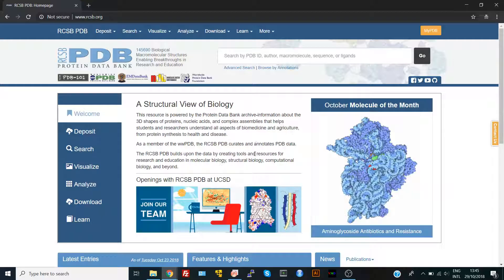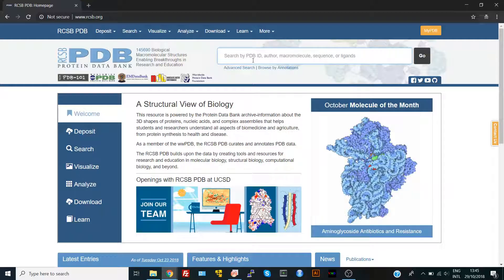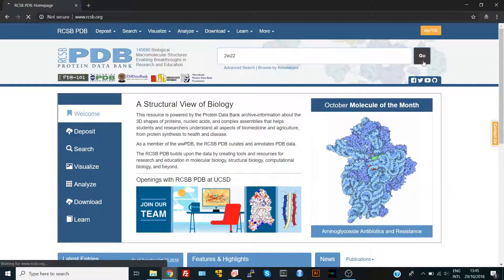The structures are crystallized mainly by two approaches: X-ray diffraction method and NMR spectroscopy. In the search box you can search by different methods, but the most common method is to have the PDB ID of a structure. The PDB ID is four characters that identify each structure in this database. For example, I used to work with a lipase which has a PDB ID of 2W22.